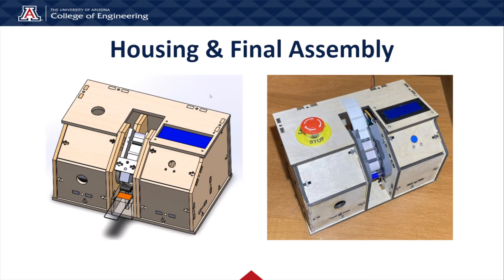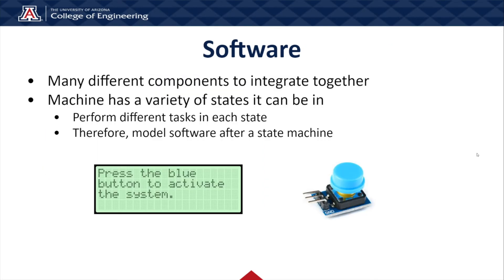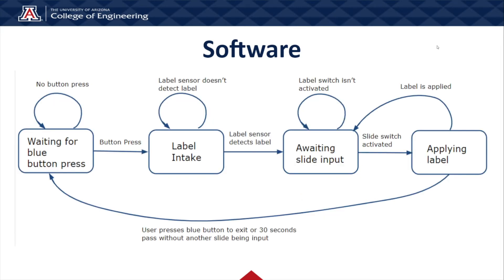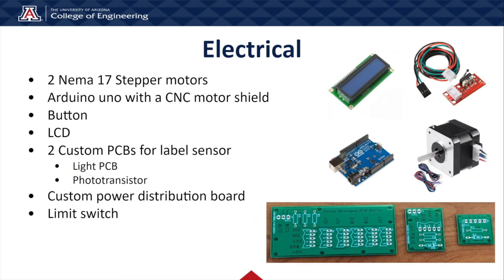As for our housing and final assembly, we chose to make it out of laser-cut plywood as our prototype. As for our software, we had many components integrate together, and our machine has many states in which certain actions need to be performed, so we chose to model our software on a state machine. Our initial state is waiting for the user to press the blue button to start the machine. Once pressed, we intake labels by running our stepper motors. Once the labels are in position, a label sensor detects them, and we wait for the user to push a slide into the machine and activate a limit switch. Once that happens, we apply a label and go back to our initial state.